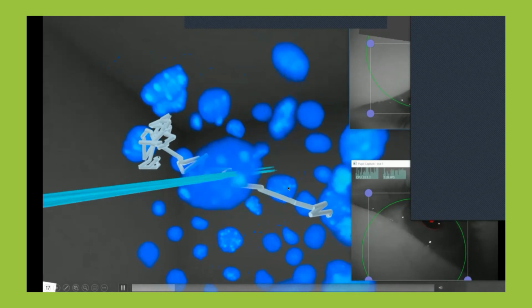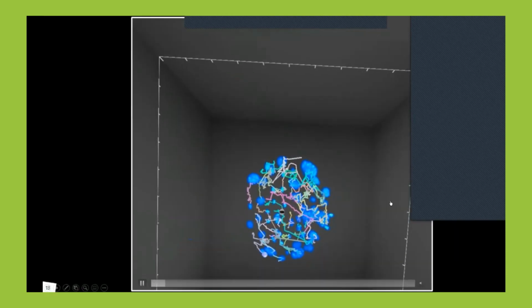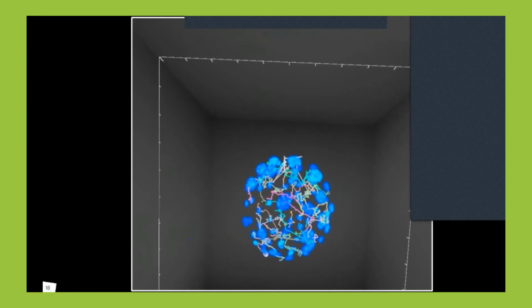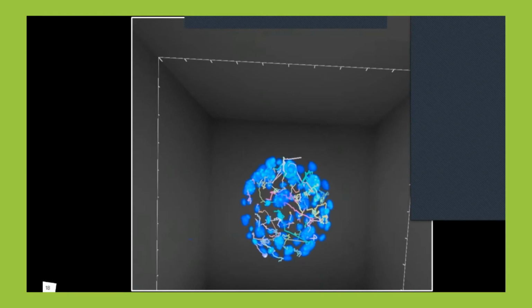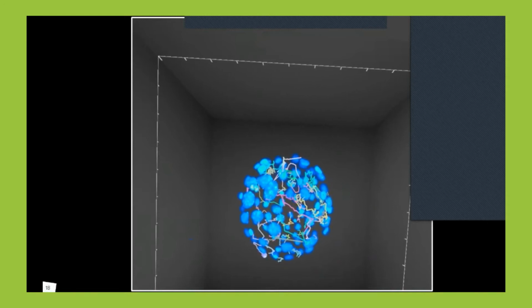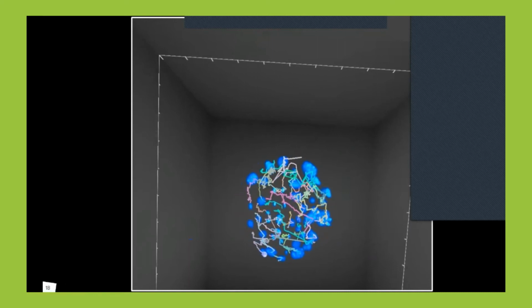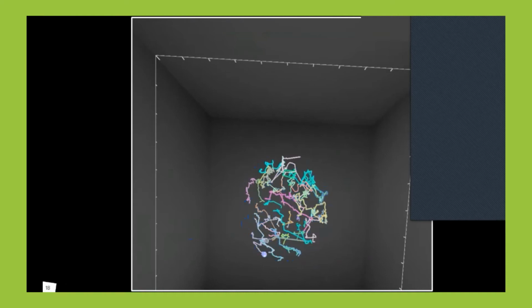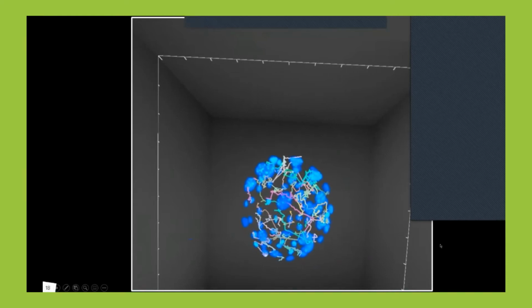Okay, and this is what I was able to do after about half an hour. These are, I think, 52 cell tracks I was able to create within this time. You can see that there are still a few that would probably need a bit of ironing out. But in general, this technique has proven to work pretty well for creating single cell tracks. So let's talk a little bit more about how it actually works.